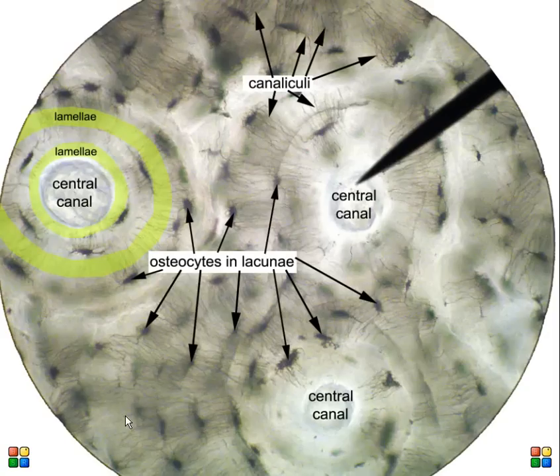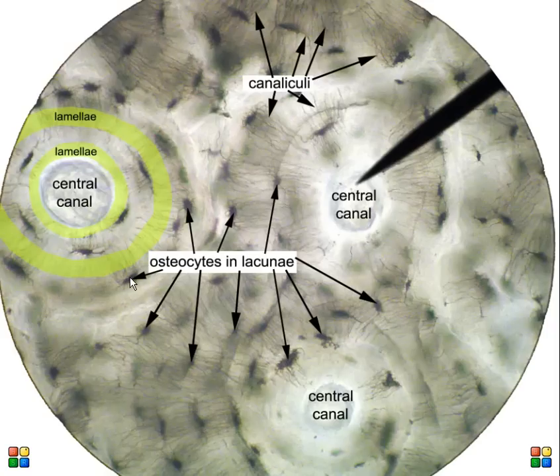This is another image I have on my website which is labeled for all of those specific structures. You can see the lamellae — the rings — the central canals, the canaliculi — these little dark lines — and then the osteocytes inside of the lacuna or lacunae.